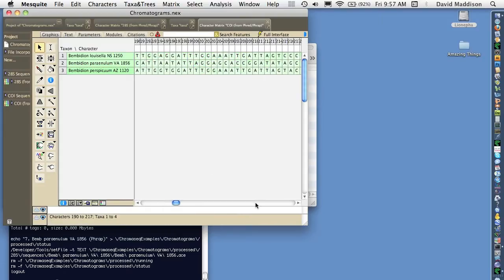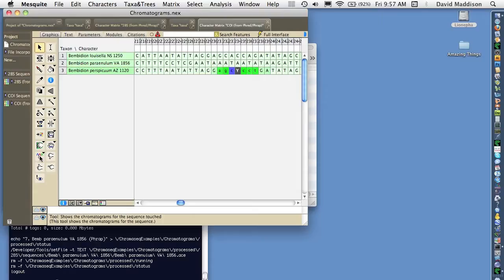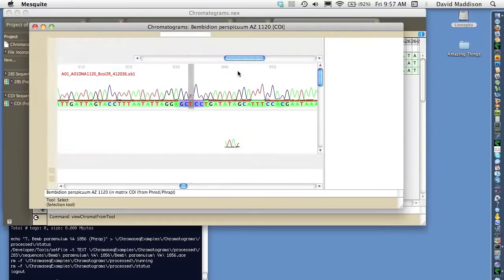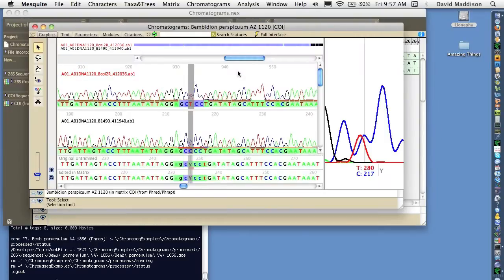We could scroll through and take a look at the contig and the chromatograms associated with it in detail using the chromatogram viewer.